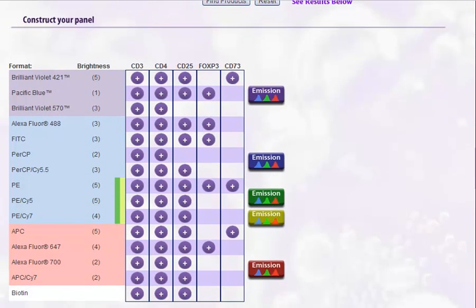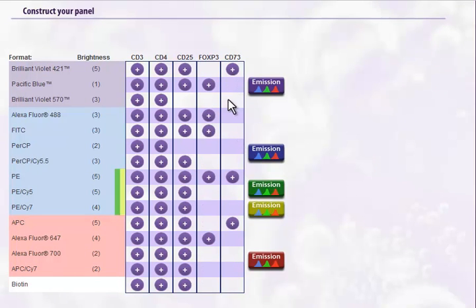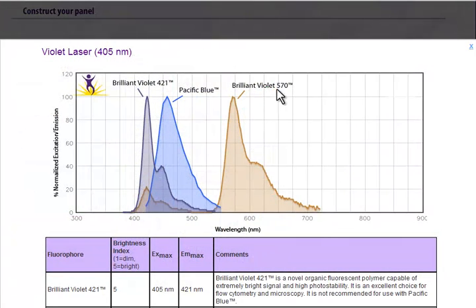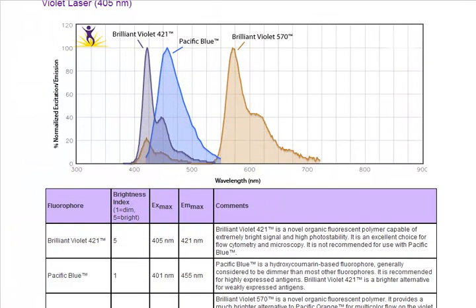The results return a matrix display of all your specificities and the formats available for each. We also provide the brightness index for each fluorophore to help optimize your panel. There is also fluorophore information grouped by lasers. Just click on the emission button to access this information.